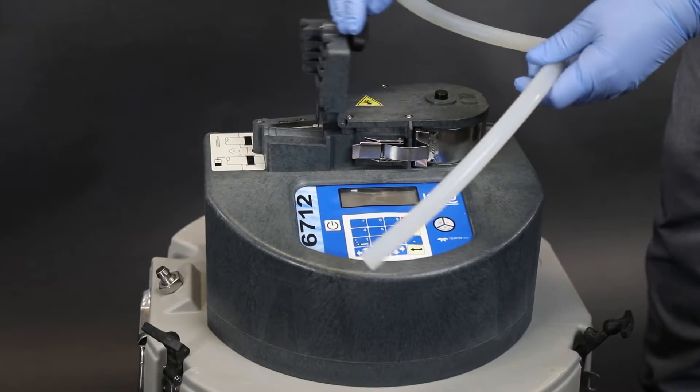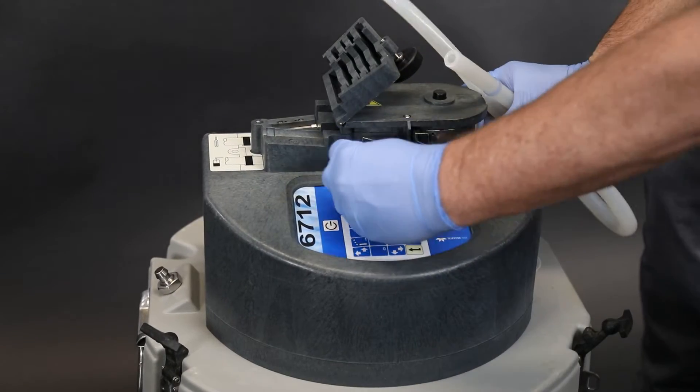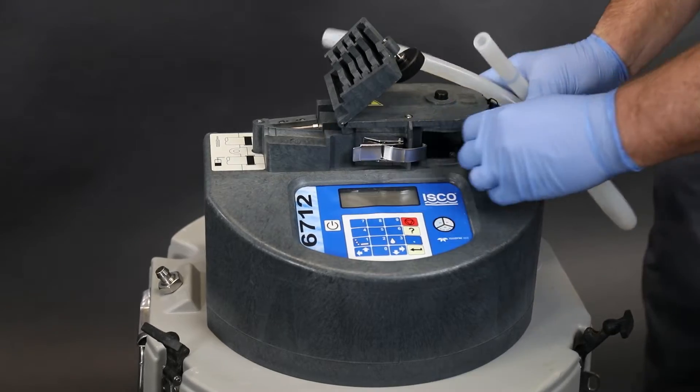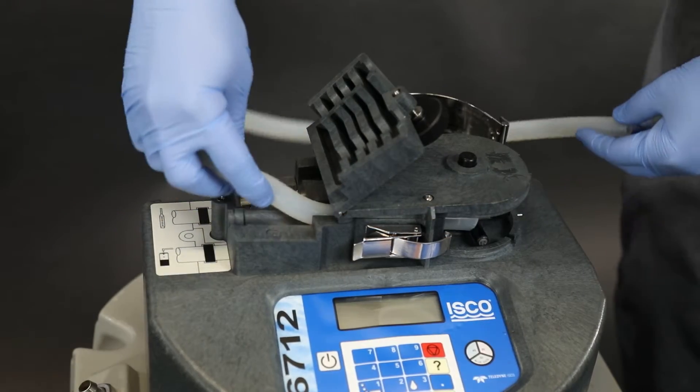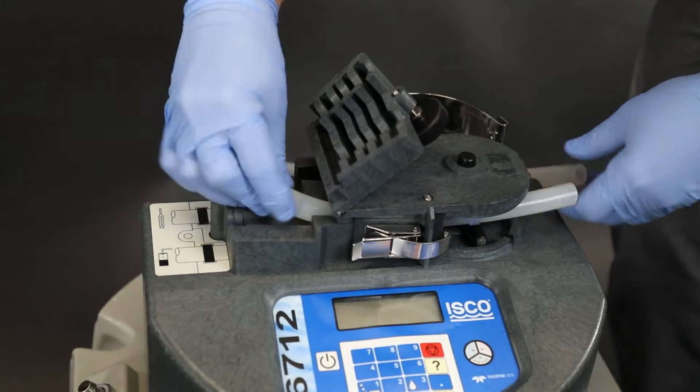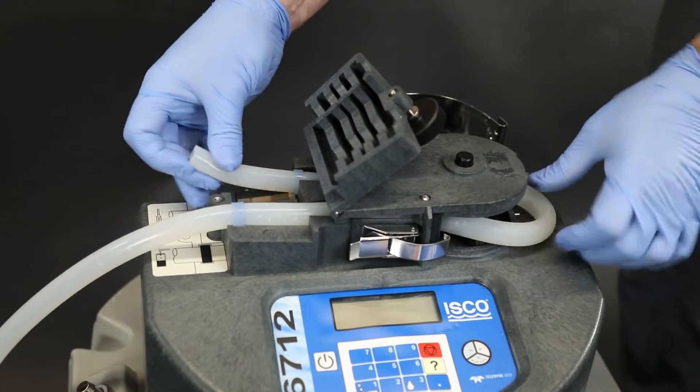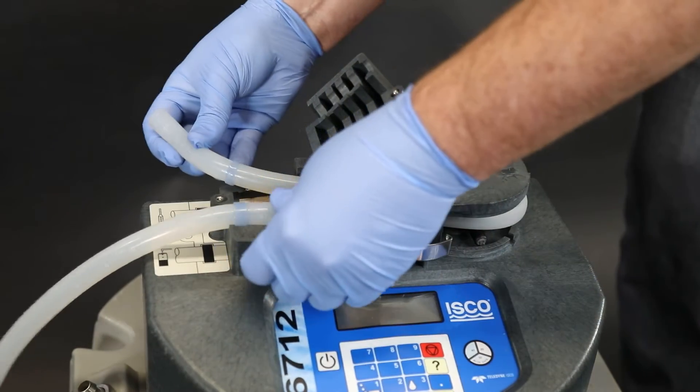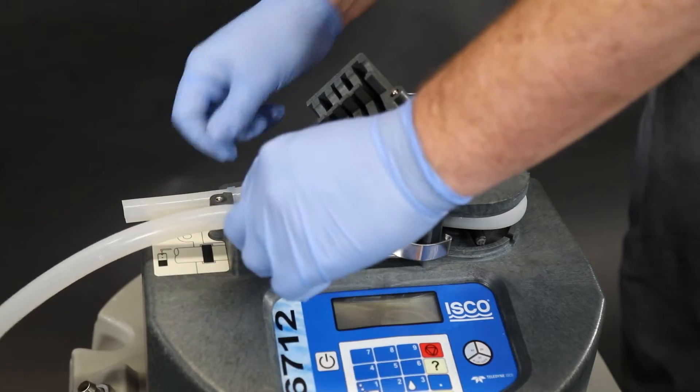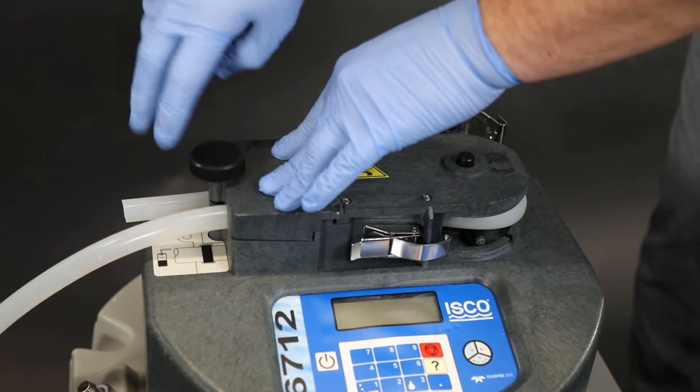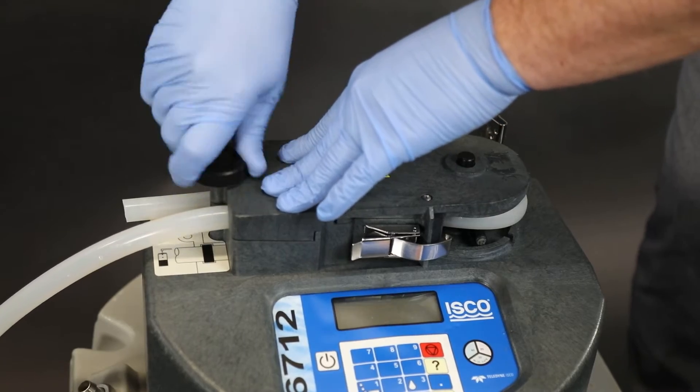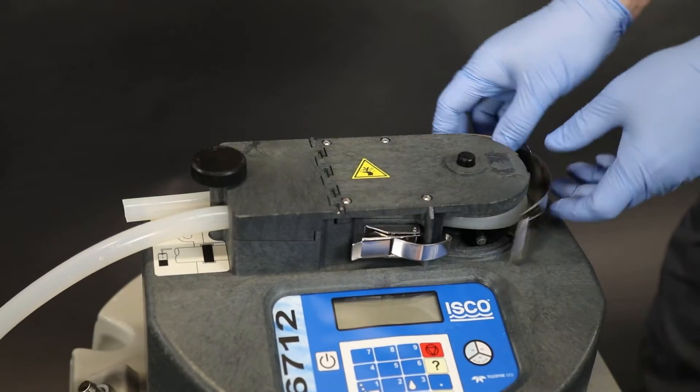To install the pump tubing, first unscrew the tube cover and release the clamp. Insert the shorter end of the pump tube as shown. Guide the tubing back through the tube housing and align the blue stripes with the notches here. Close the tube cover and screw it in, then lock the clamp.